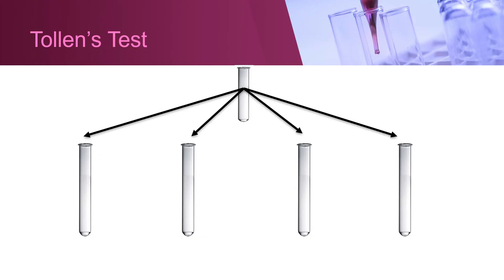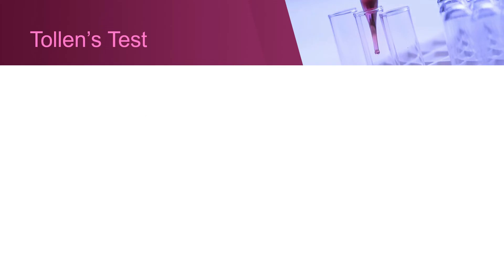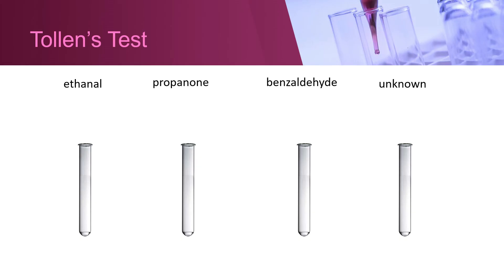Divide the Tollen's reagent equally into four test tubes. Place approximately one milliliter of ethanol, propanone, benzaldehyde, and unknown in the test tubes accordingly.